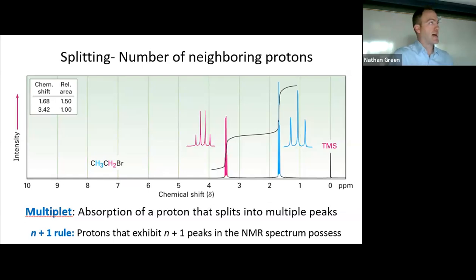For those of you taking the lab, I hear you had a very fun time with NMR. Sarah and I had a powwow yesterday, and she was like, hey, apparently I did NMR before you, and everyone was really confused. And I was like, that probably makes sense. If you take the lab, she gave you real world NMR data. And so for many of you, you probably realized, one, I don't know what this is, and two, if you look at it again, the splitting patterns are worthless. You can't get anything out of it. It's just fuzz, right? So you don't always get a splitting pattern.